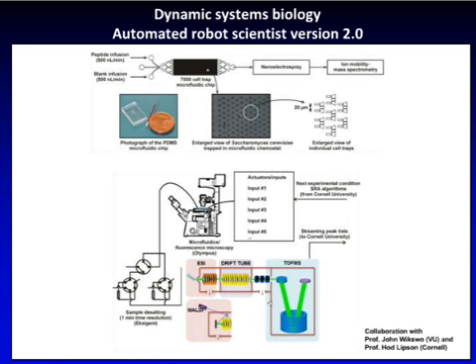So we put one of these microfluidic cell trapping devices underneath an inverted fluorescence microscope. You perfuse cells into the traps to load them. And then you use hydrostatic pressure to hold the cells in the traps. Now, if you start putting chemicals or toxins or drugs into the cell culture media, you can watch all the molecules that the cells release, basically in real time.